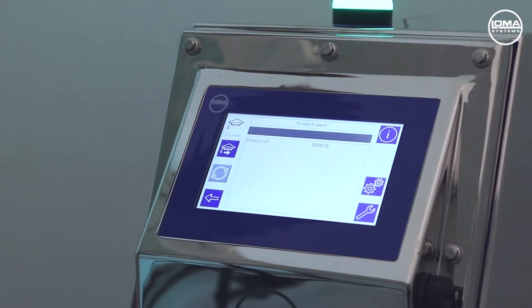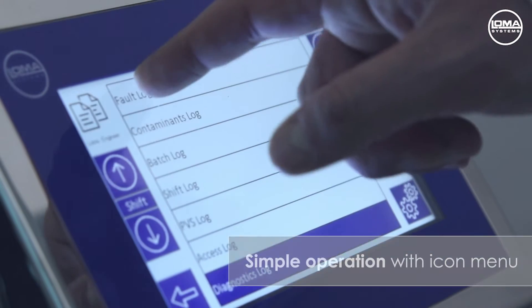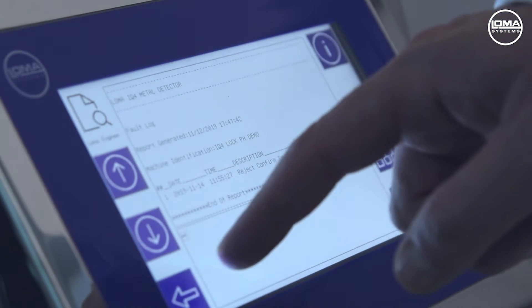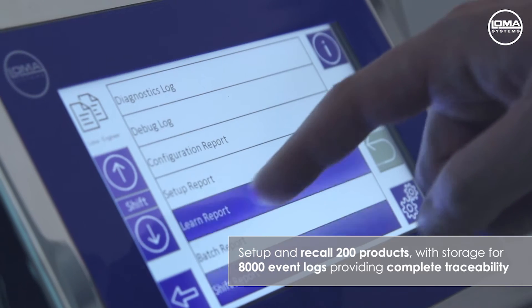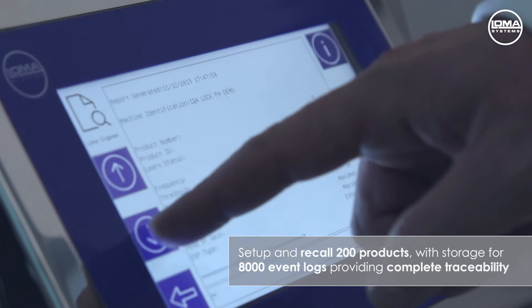The unrivaled 7-inch colour touchscreen ensures maximum functionality and the icon-driven interface ensures simple operation from the digital search head. You can set up 200 products to simply recall, and the unit stores 8,000 data events. These are always stored within the system, even with any power outage.